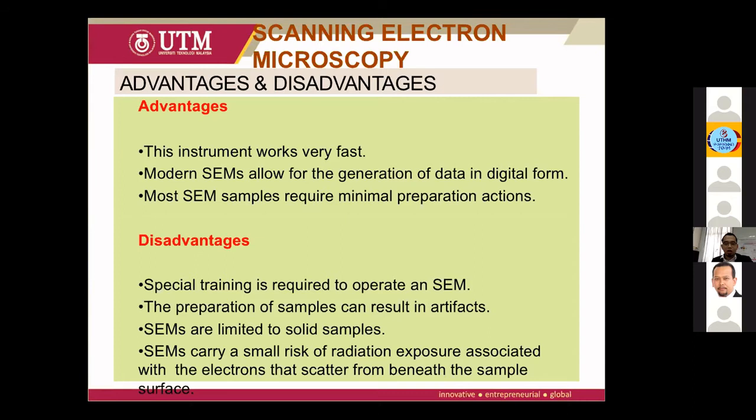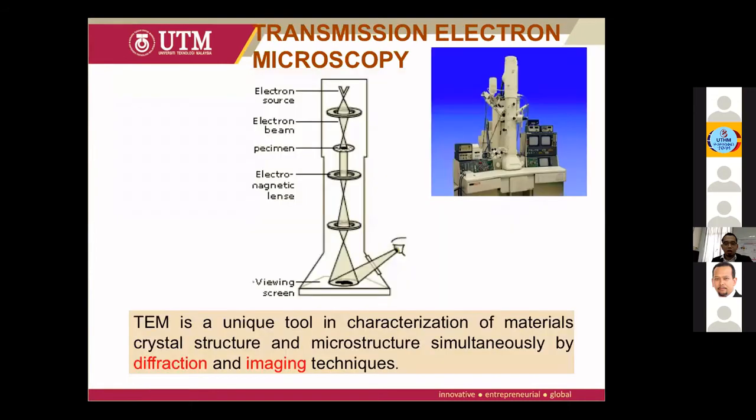Okay, right. So when you are asked to do your SEM image, don't just simply rely on the operators, but please provide them with the image that you intend to have. Let's say you are going to do work on zeolite and it has special images or structures there. Make sure you tell the operators what the intended morphology is that you are going to have. Okay. So this is the second microscopy that we are going to discuss today.